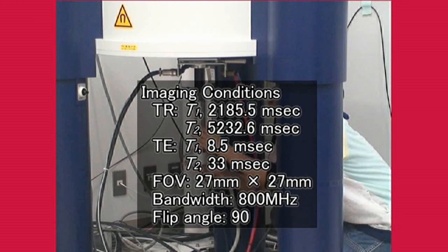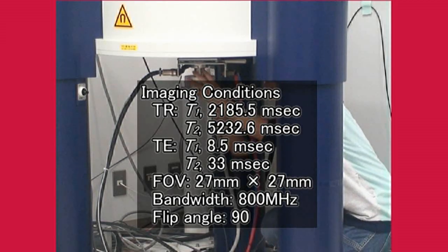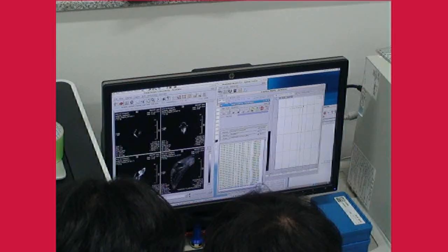Furthermore, various adjustments and imaging conditions were set for the equipment from the computer, and imaging was started as soon as the preparations were completed. This time, preliminary imaging is performed under some conditions. Images with the imaging position changed every 0.25 mm are repeatedly imaged multiple times. And these are superimposed to create a fine textured image.